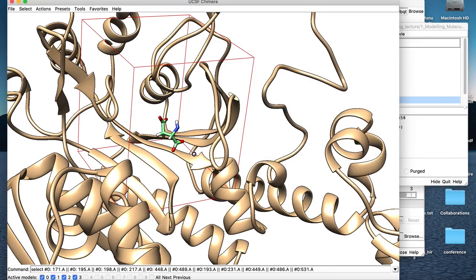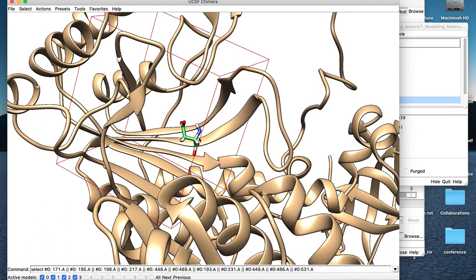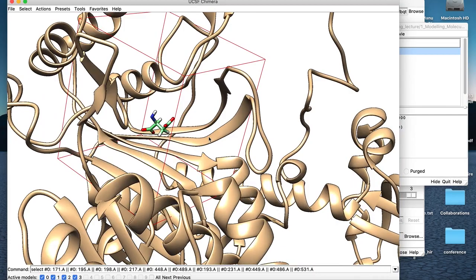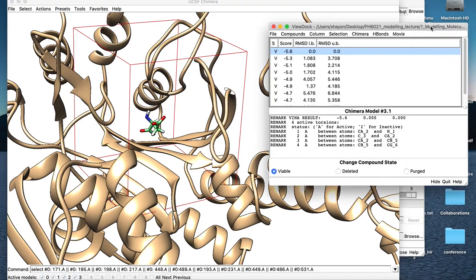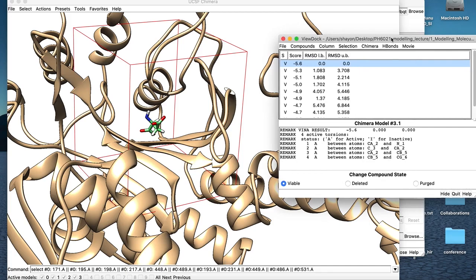And then finally model 10, where it's also a little bit away from the binding pocket. So compare that to model 1 again, you see it's a perfect fit. Okay, so we are judging this based on the binding affinities themselves. But how about when we compare them with the experimental structure? So we already saved the experimental structure previously with the L-Asp modified residue. So we modified the AMO to ASP in the ligand.